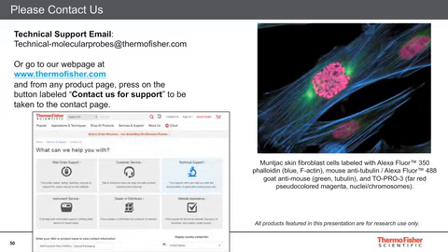Okay. My lab makes its own anti-fade mounting medium. Why not go with our own formulations? I've helped develop some of the anti-fade mountants here, either directly in R&D or as an advisory. And I can tell you we've tried every possible homebrew remedy that we have found that have been reported by labs or put on web pages.